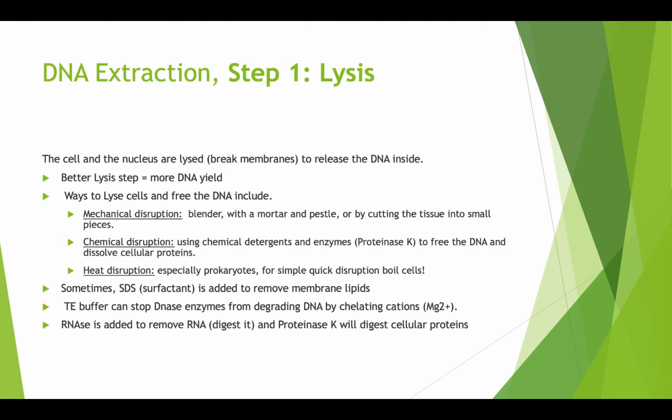هلا إذا أنا بدي أبلش بالDNA, I want to start extracting the DNA. So I have a cell, I have a eukaryotic cell, I have a prokaryotic cell. I need to start extracting the DNA. You will find that extraction of DNA عادة takes a few steps. أول step وأهم step quite probably is to break the cells apart.